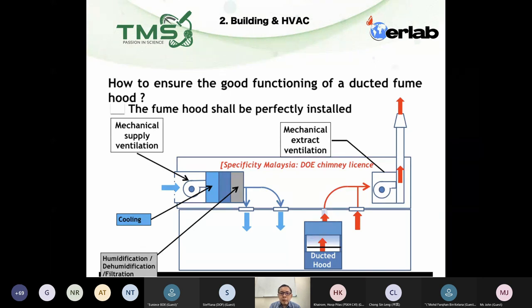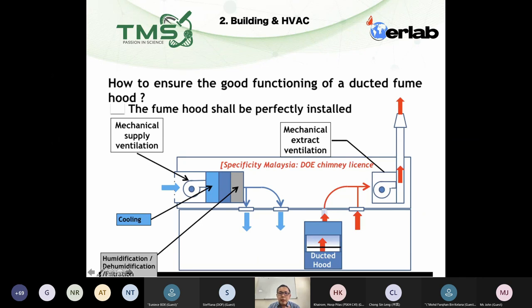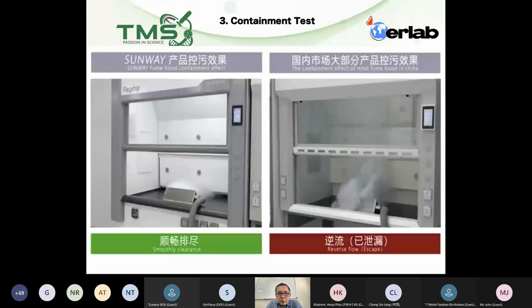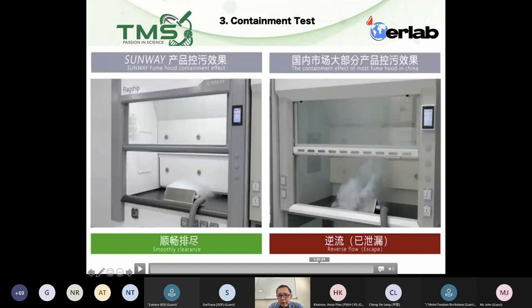The second factor to consider is the facility structure: does the building have enough makeup air coming into the lab? When you have a ducted fume hood drawing air out, you must ensure sufficient makeup air so the room pressure doesn't go too negative. For ductless fume hoods as well, you need to make sure the system has gone through a containment test.